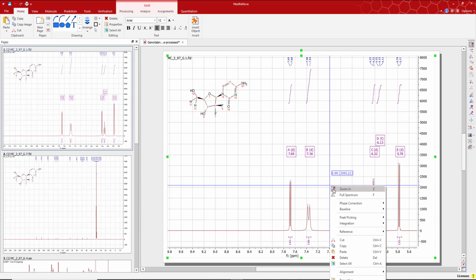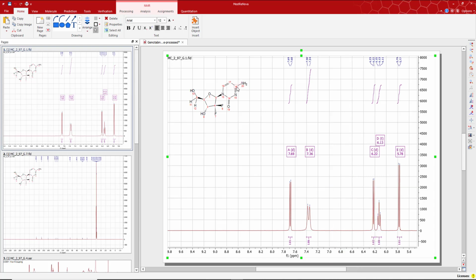And in actuality, it isn't a doublet. There are no neighboring protons here on 16. What that actually is, is there's a lot of double bond character in this carbon-nitrogen bond from 16 to 20. So what ends up happening is that there's a fairly prominent resonance structure where these lone pair electrons on the nitrogen dump in to make a double bond from 16 to 20.